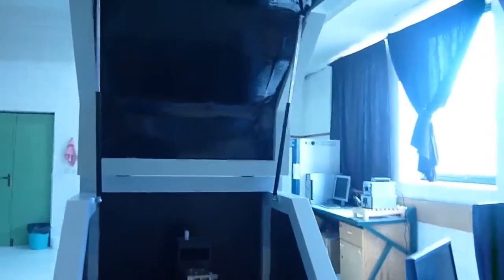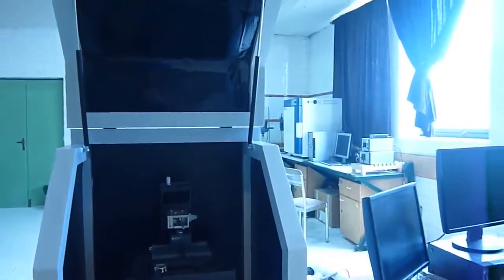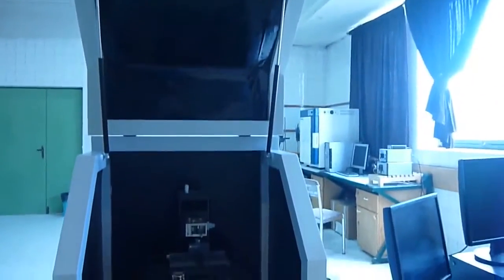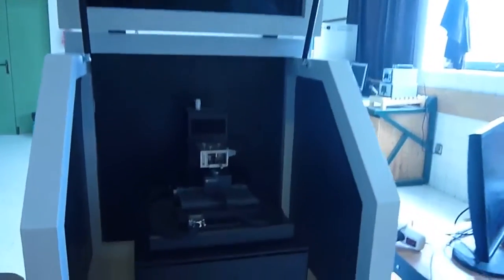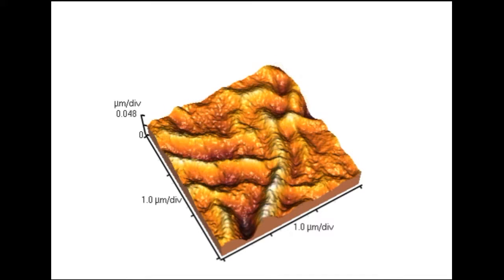The operation methods of AFM are generally classified into image formation and the others. The image formation is a plotting method as a color mapping. Color mapping is introduced as a function of the origin through changing the x, y position of the tip by scanning and corresponding some particular measured variable, the intensity of control signal, to each xy coordinate. In this respect, the color mapping is a method which corresponds a measured value to each coordinate and shows it.